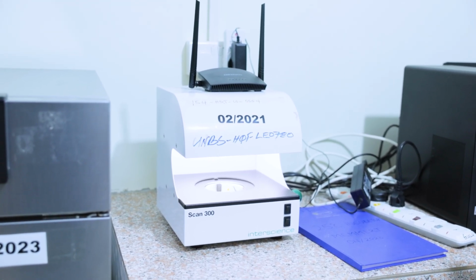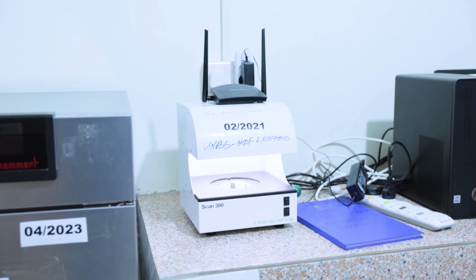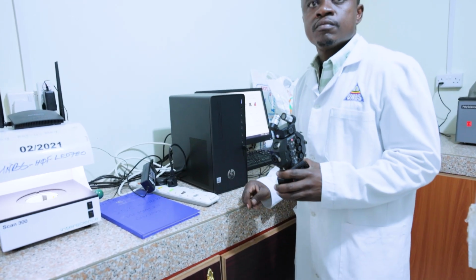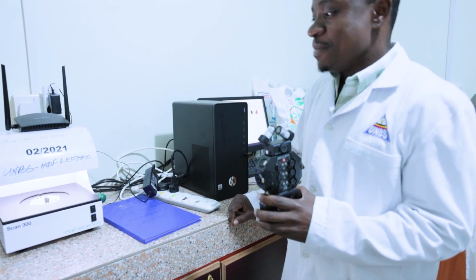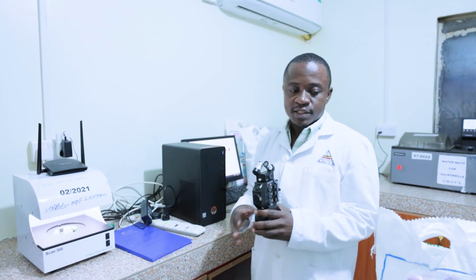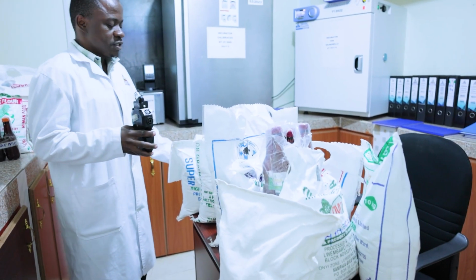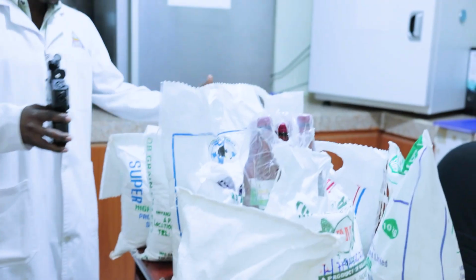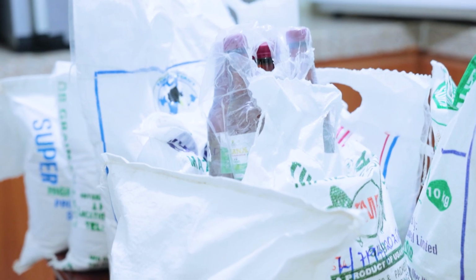When we get our results, we put them in the system, and then we do the certificates and everything else that goes on. So all the colonies of bacteria. Anyway, we don't do viruses, but bacteria. You can see these are samples which are going to be worked on. We still have issues with space, but we are trying to handle it for now. These are samples that have come from clients which are supposed to be worked on.